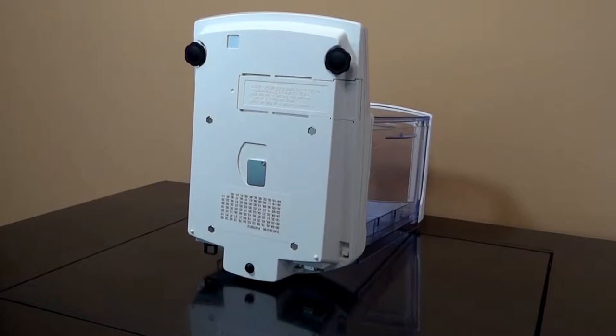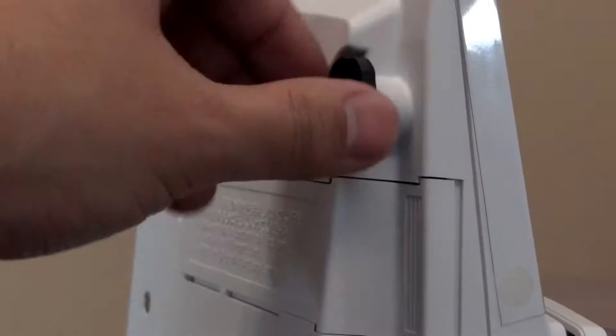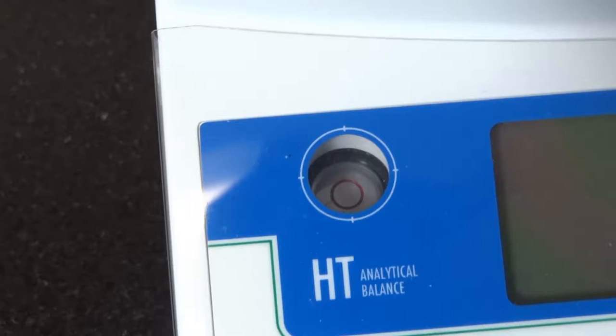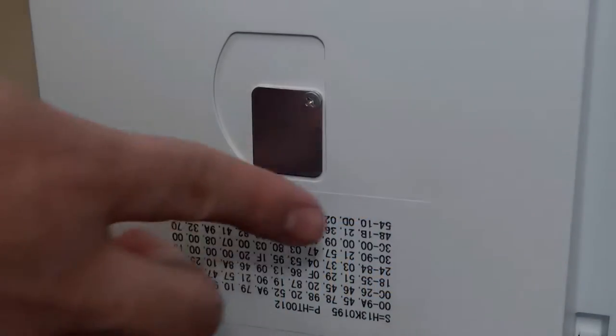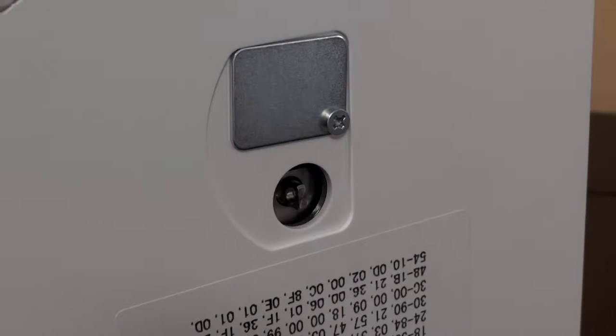Starting from the bottom of the balance, the HT has three support points, two of which are adjustable, and there is a spirit level next to the display to help with leveling. The metal plate under the balance can be rotated to reveal a hook used for under-balance weighing.